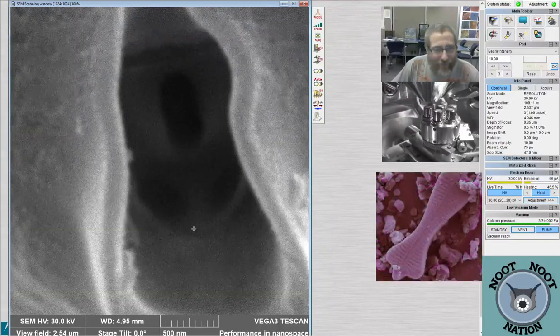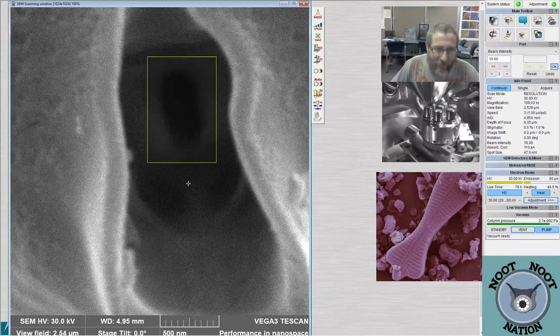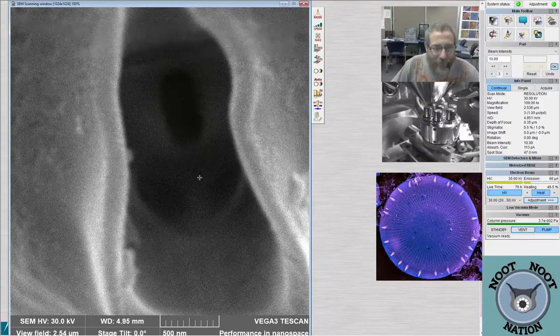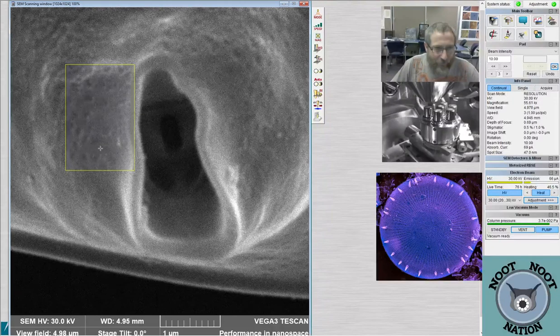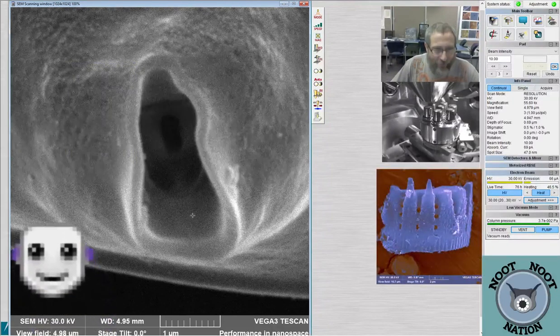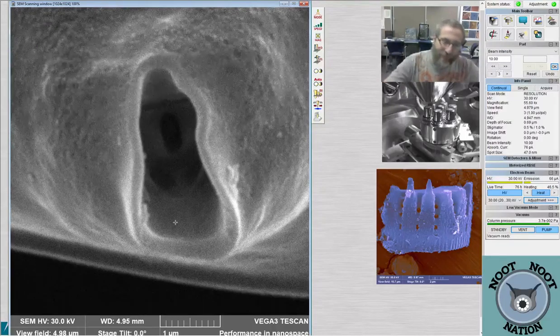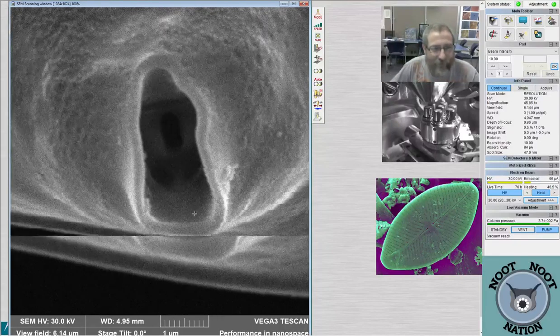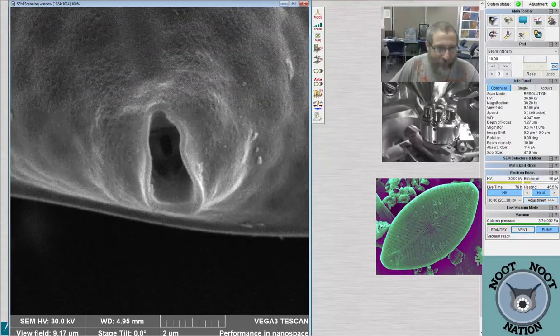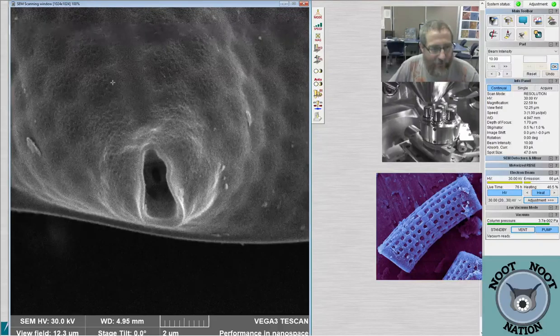Somebody asked, I don't think we've ever had this view before. Yeah, it's hard to get the external views of them. It's kind of hard to get it in focus because the problem is not that we don't have the resolution, but that it's inside the diatom, inside the hole. So the electrons go in, they hit the surface, and then electrons come out of the hole, and just a few of them make it to the sensor at that spot. The challenge is basically that not a lot of the information is getting back to the receptor.